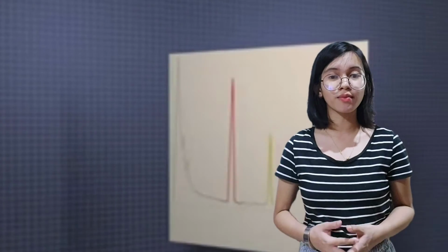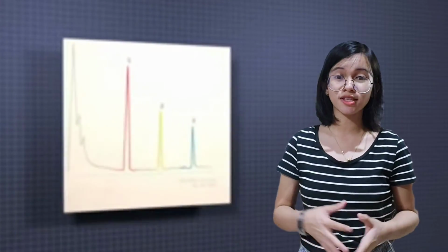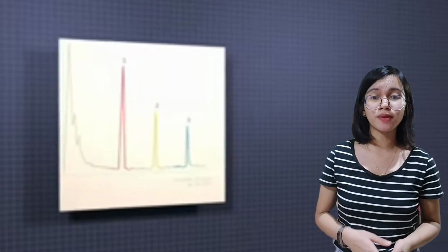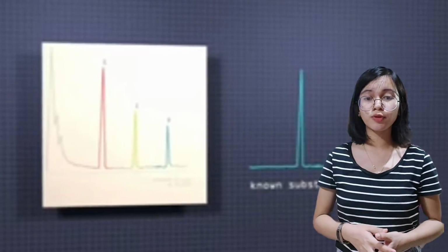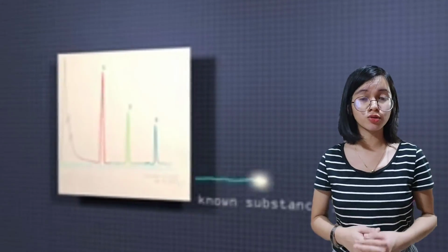The detector sends an electronic signal to an amplifier, which prints a chromatogram representing the exit time and amount of each compound with a series of peaks. Comparing these peaks to the patterns known to be produced by certain substances, narcotics for example, offers clues to the composition of the original sample.